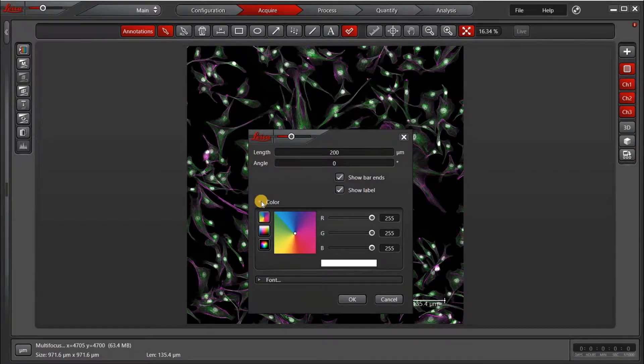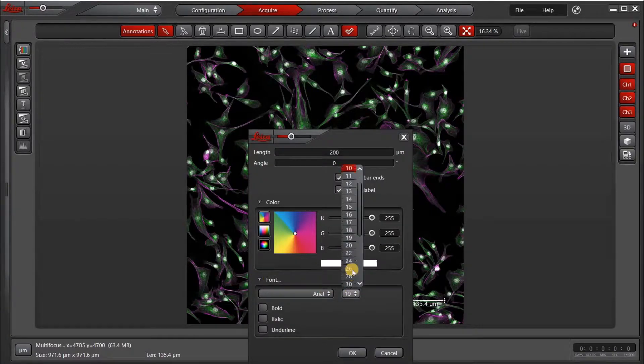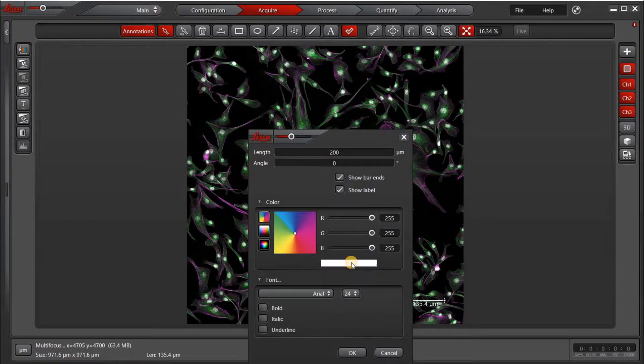I have some options here. I can select the color and also the font. So usually these are a little bit small, so I'm going to go ahead and click 24-point font.